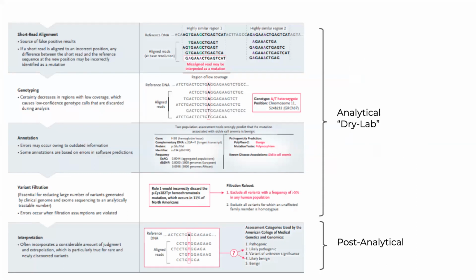After that, the process of analyzing that data will look at the short reads that come from a particular gene, the BRCA1 gene. The BRCA1 gene will be compared between an individual and a reference, and then the variants that are most prominent in that sample will be reported.